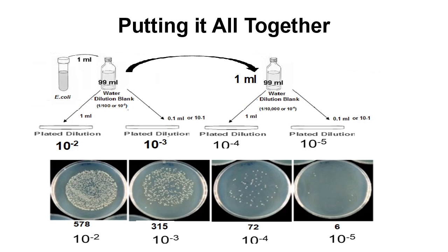So now we can take our colonies and calculate how many cells were in our original test tube to start off with, with our E. coli.